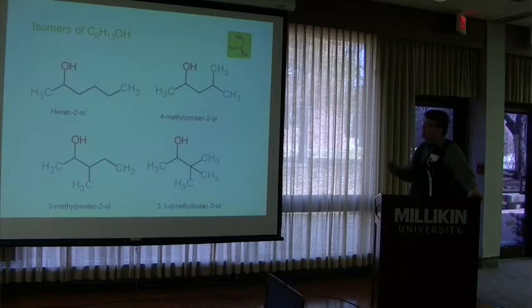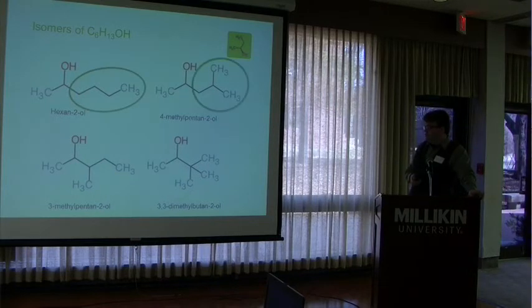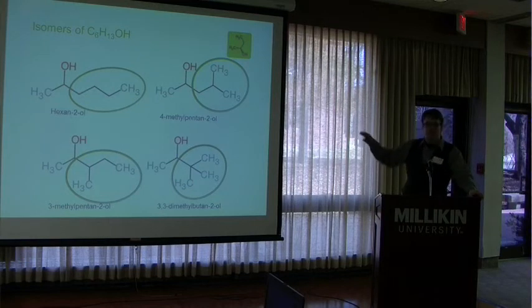And you'll notice that we're keeping the first 2 carbons the same, the 1 carbon and 2 carbon with a hydroxy group, and just the side chains here are changing. This is so that we can observe the effect of this branch on the specific rotation, leaving the hydroxy group constant.